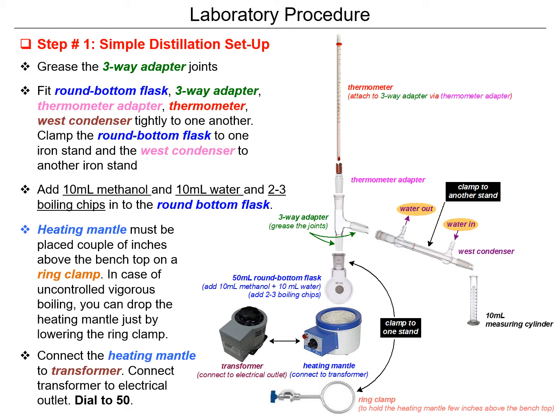To attach the thermometer, we use a stopper — because there is usually no glassware that directly adapts the thermometer, so most of the time a stopper is used, though if you have a specialized adapter in your laboratory you can use that as well. After attaching the thermometer, connect the condenser and make sure the measuring cylinder is positioned right below the mouth of the condenser. Then you are done with the assembling.